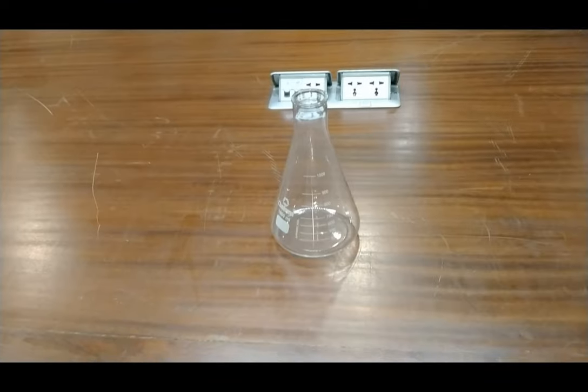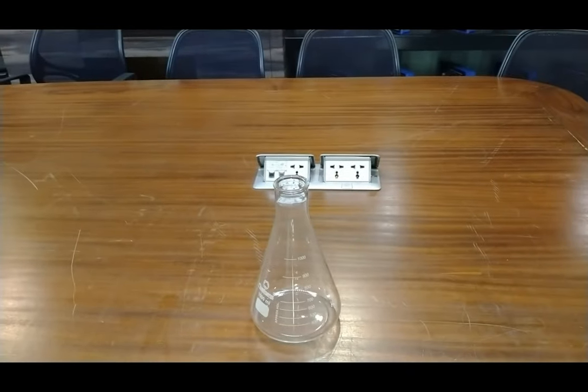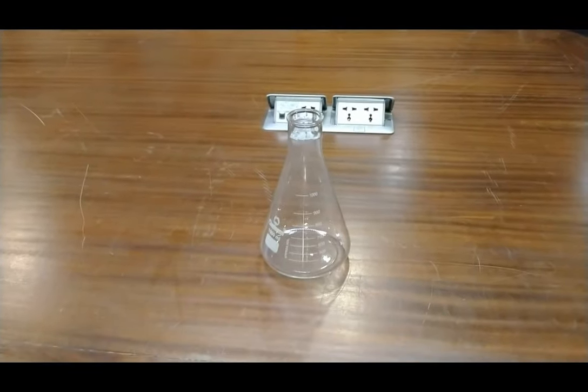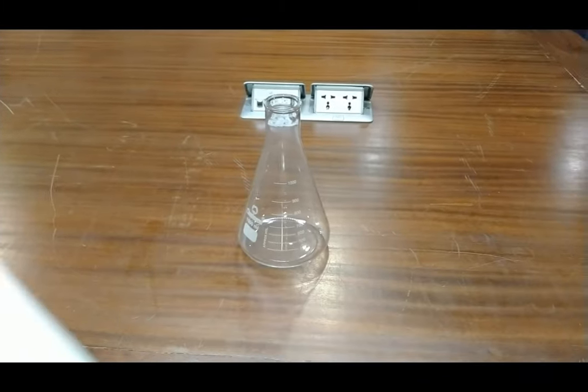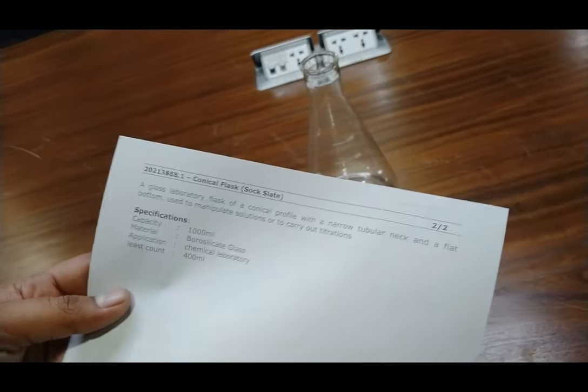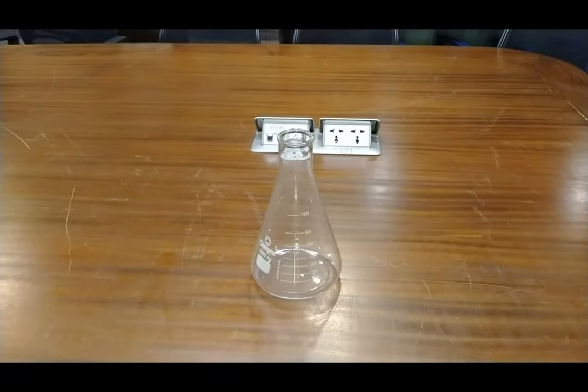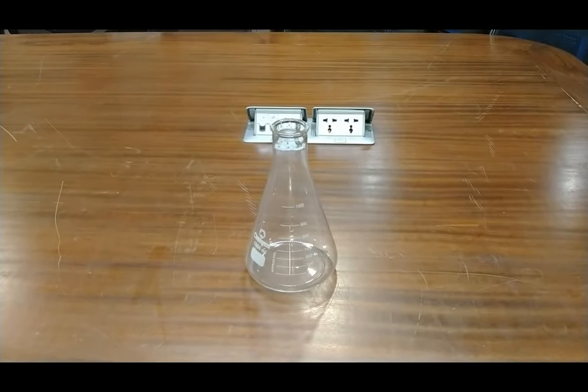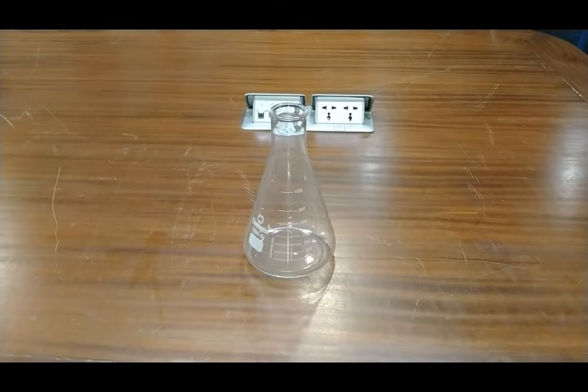Hello guys, welcome to Tesca Technologies Private Limited. This is a conical flask, and the order code is 20213868.1. A conical flask is a glass laboratory flask with a conical profile.